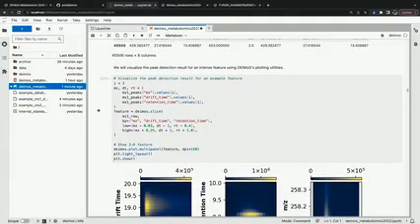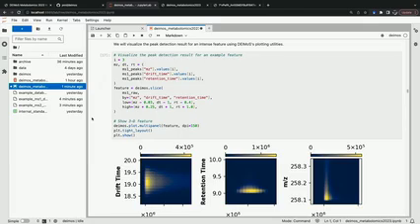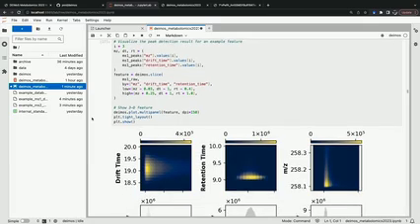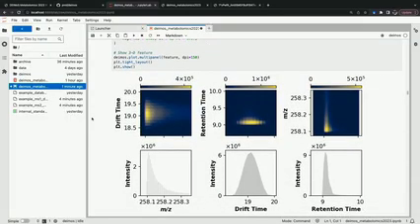And then just to visualize one of the features, we're including another plot that DEIMoS can generate, this multi-panel plot where you can visualize in each dimension what a feature looks like. Here we've pulled an example feature from that peak picked list and are visualizing what that looks like in 3D.